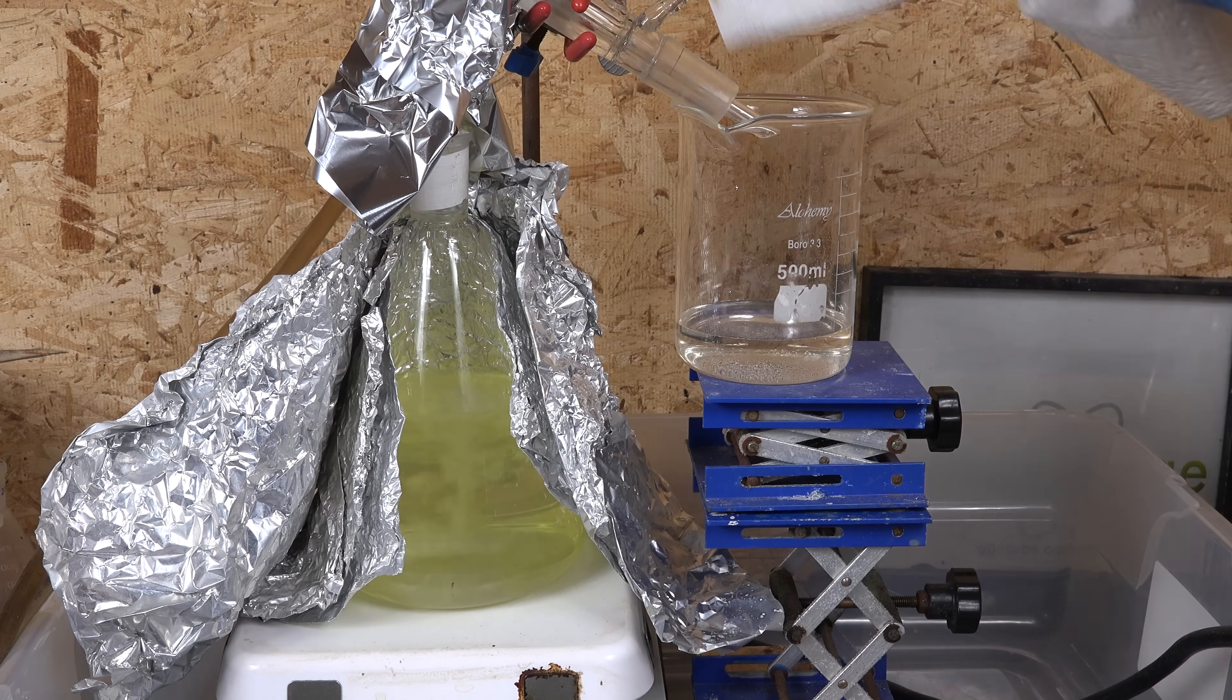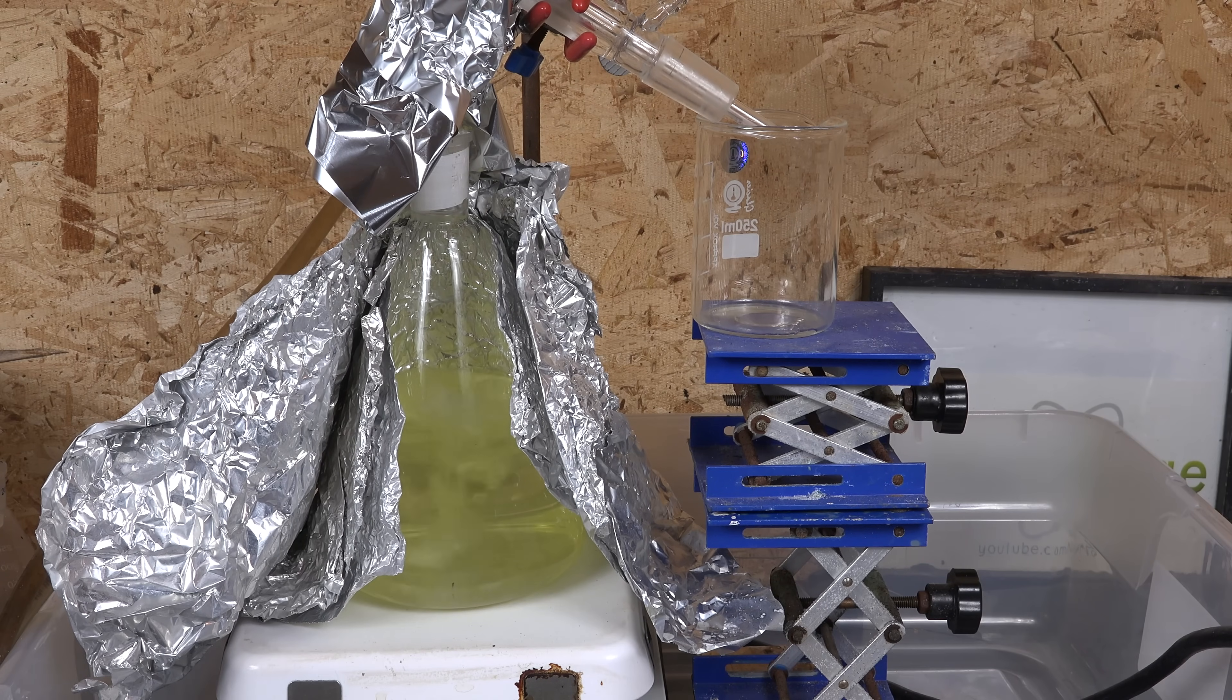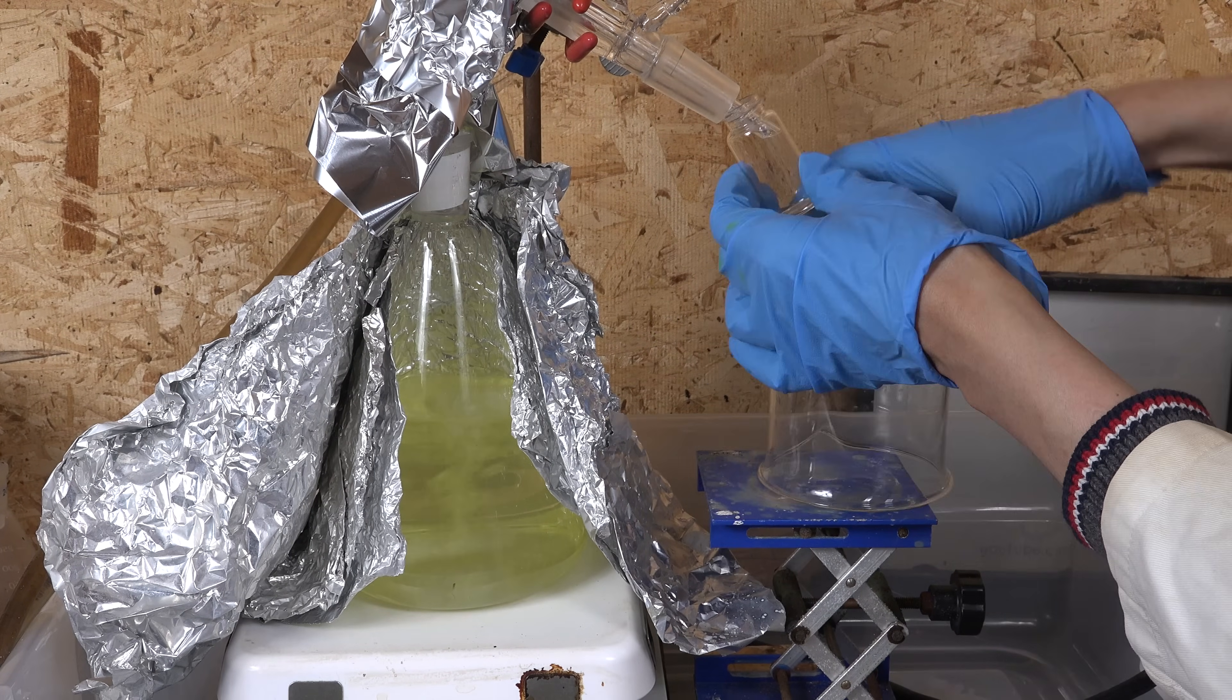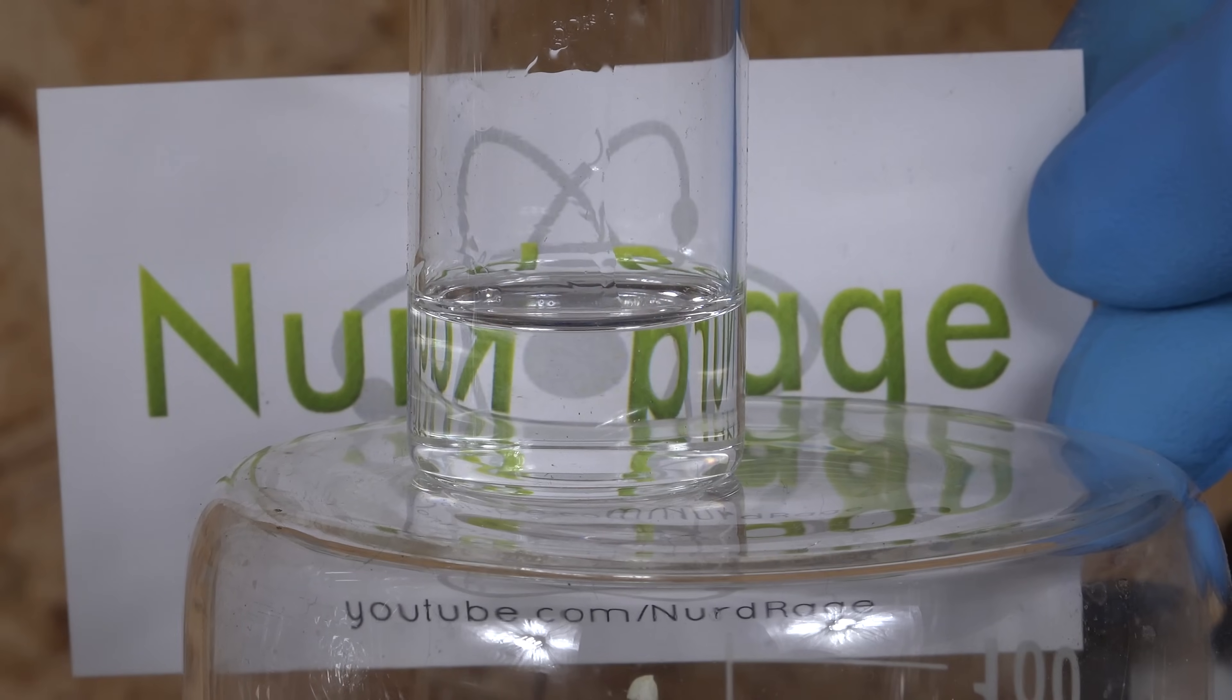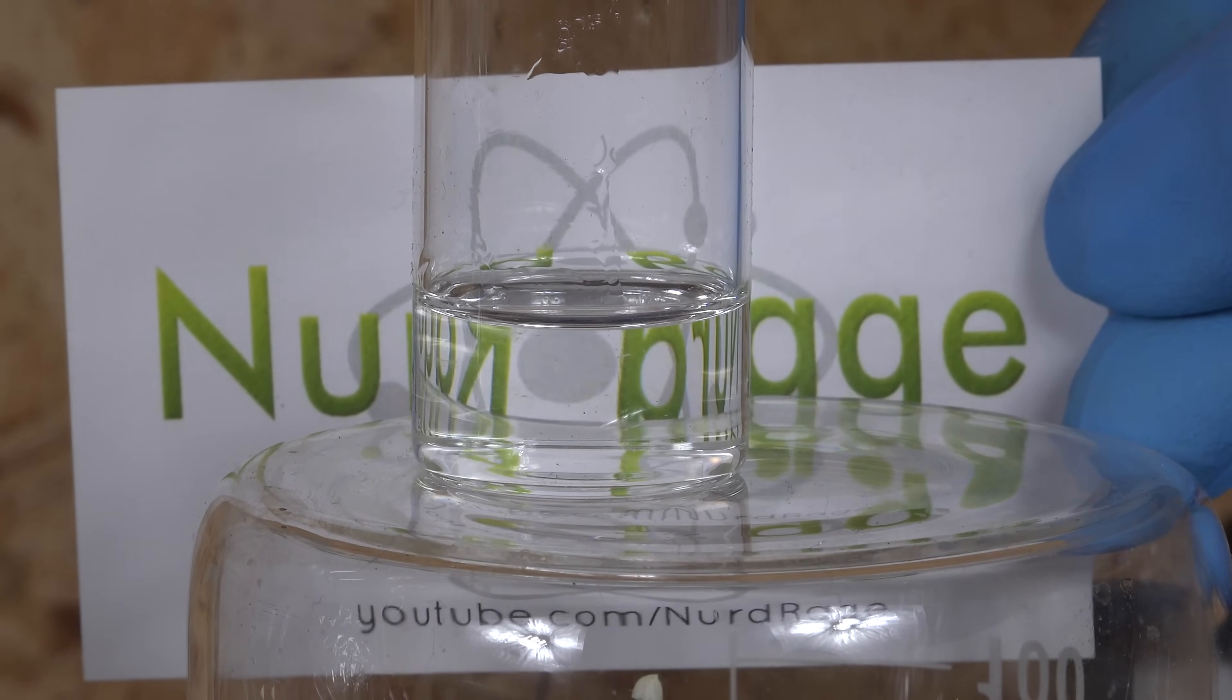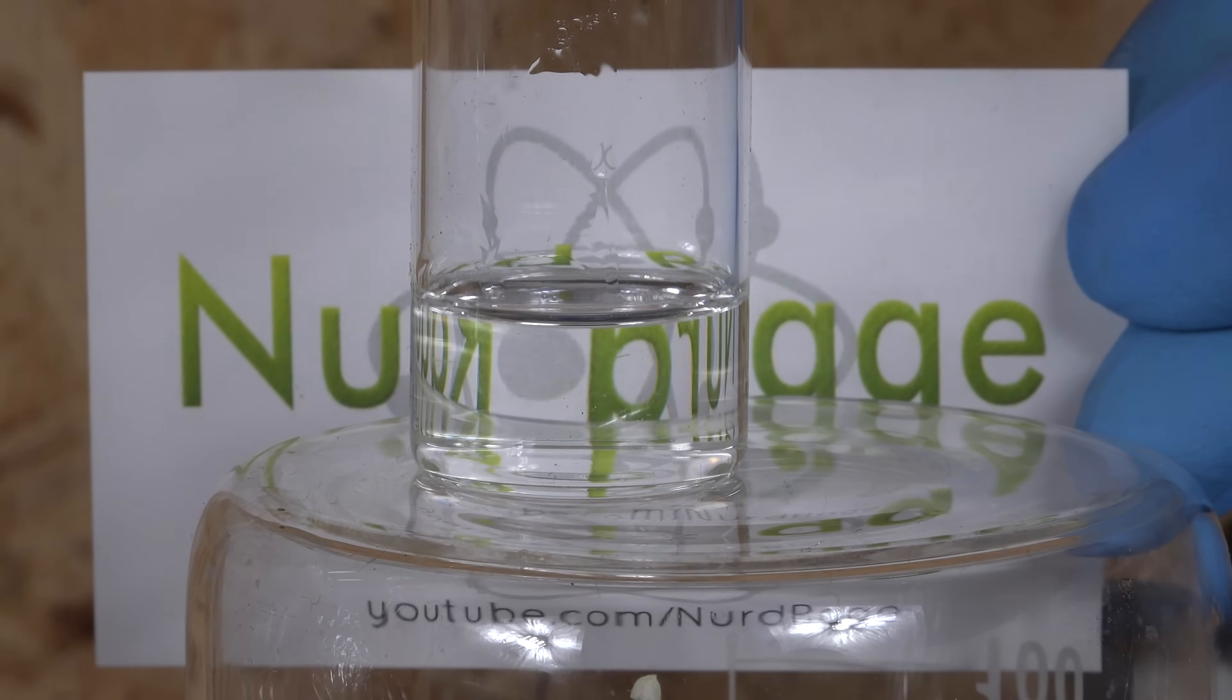Looks like I'm distilling sulfuric acid now. Let me change out the receiver. Now we want the highest concentration of sulfuric acid we can get which is the 98% azeotrope. We're not quite certain if we're there yet but a way to tell is to simply use a small receiver and carefully observe it while it's collecting. It helps to put a high contrast background. Anyway, if there are distortions in the liquid as it drips then that means the drops are of changing density and still rising. It looks like I have no distortions and that means I'm distilling constant density sulfuric acid which can only be the maximum 98% concentration sulfuric acid we're aiming for.